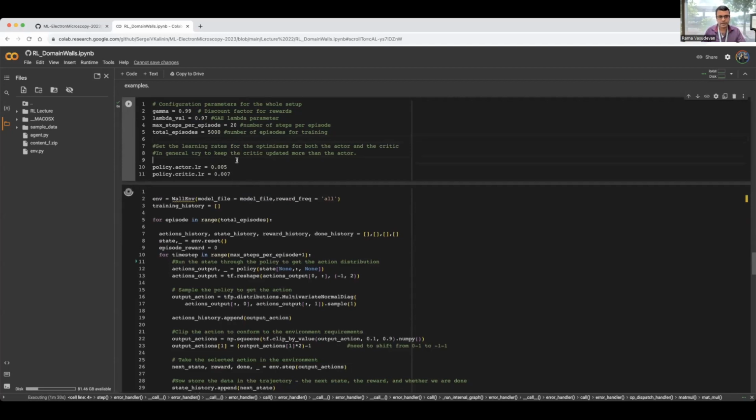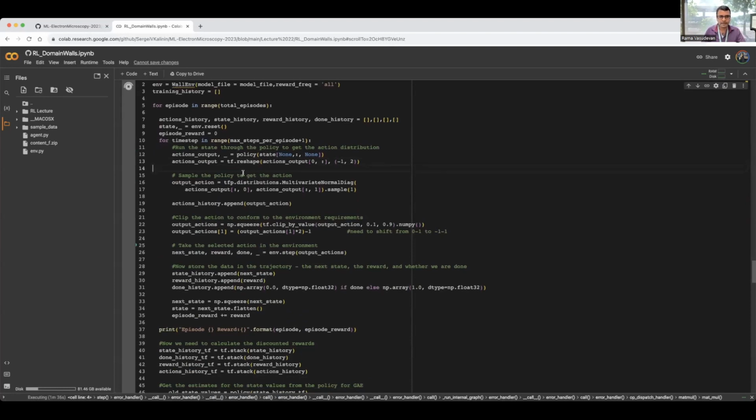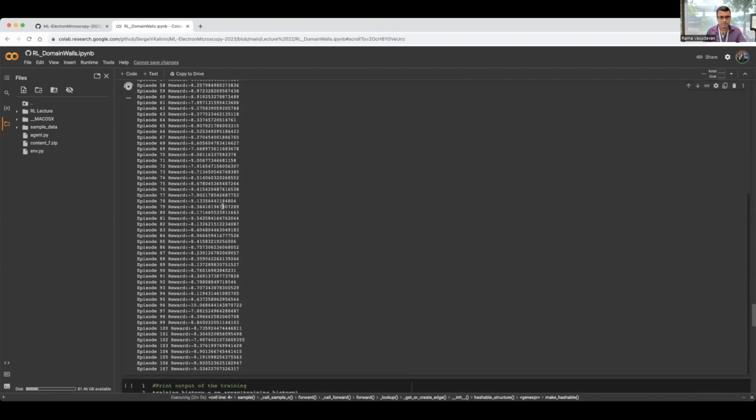And similarly, if you have environments which are not representative of your actual environment, in other words, if the surrogate model that we create is not providing the same kind of results as what we got in the actual microscope, then that can also be an additional source of error that can prevent you from learning good policies that you end up deploying. So these are things to keep in mind when you actually use reinforcement learning.